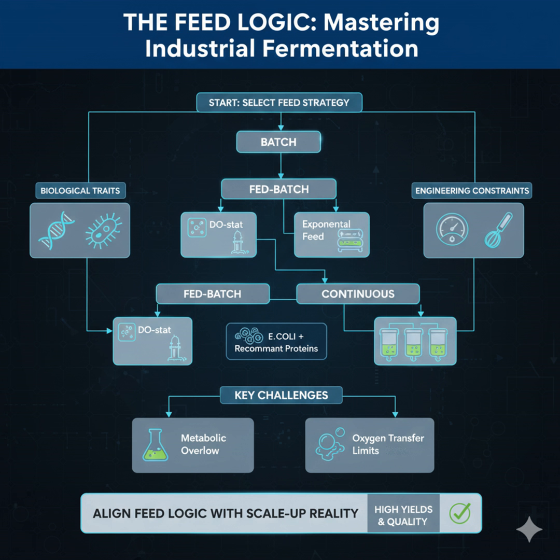So for you listening, assuming we've landed on the industry standard, fed batch, the next step is the real technical hurdle. Step 4, selecting the control philosophy. Once we've decided we need to feed, we have to decide how the brain of the bioreactor is going to control that feed rate. And this really defines your success. Yeah. We have to decide what the intentional regime for the residual substrate is. Do we target, say, strict carbon limitation, keeping residual sugar near zero to minimize repression and maximize respiratory yield?